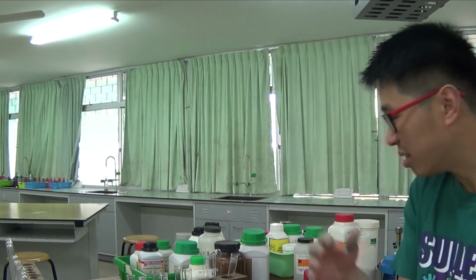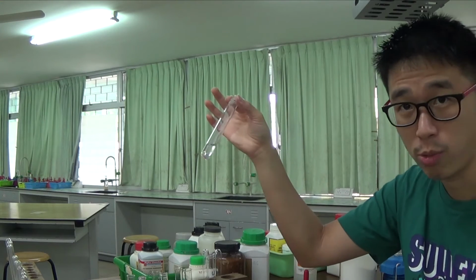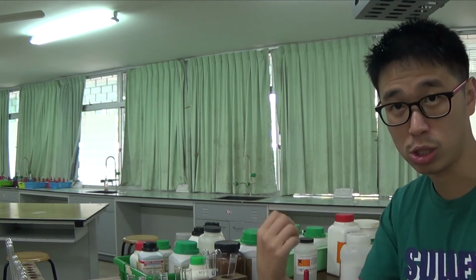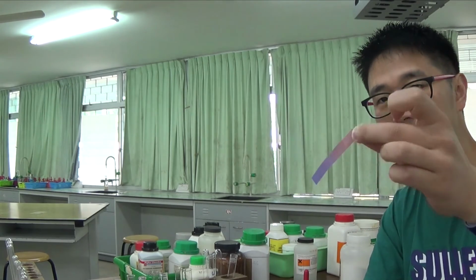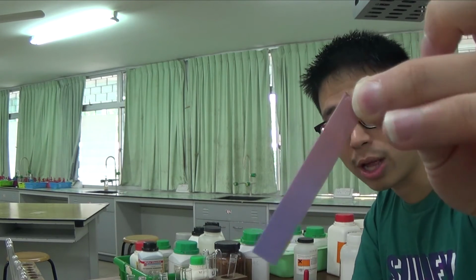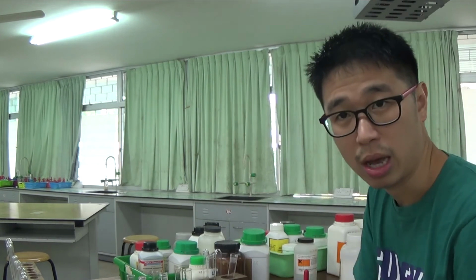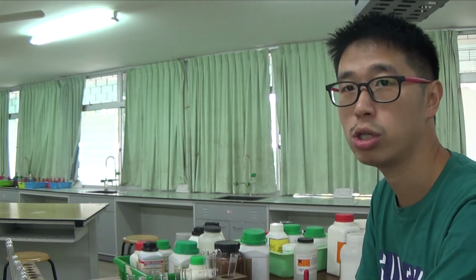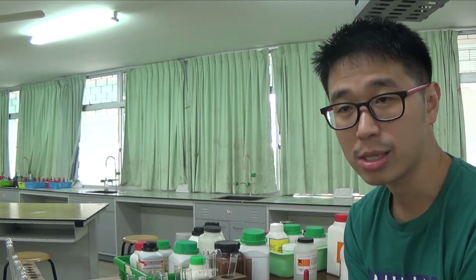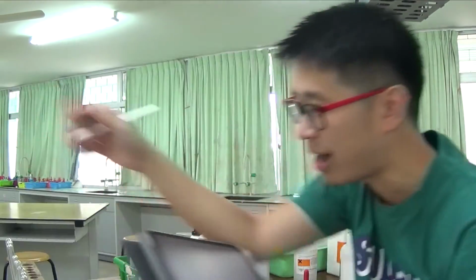So my observation is, in the presence of excess ammonia, I get a colorless solution, so the white precipitate dissolves. When I heat that solution that contains excess sodium hydroxide, I get a pungent gas. The pungent gas turns red litmus paper blue, okay? And therefore the gas is ammonia. If the gas is ammonia, the solution that I heated in the presence of excess sodium hydroxide must contain ammonium ions.